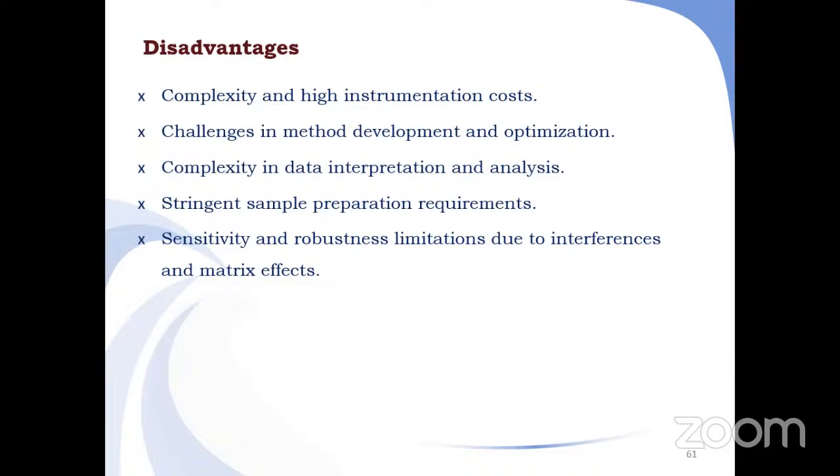But the LCMS method is a preferred method for biological matrices estimation, and is used for pharmacokinetic parameters in the explanation of samples. This gives an idea of the various hyphenated techniques apart from LCMS. The different hyphenated techniques along with LCMS include GCMS, gas chromatography and mass spectrometry, LCNMR, liquid chromatography nuclear magnetic resonance spectroscopy, GCIR, GCNMR, and LCIR methods.